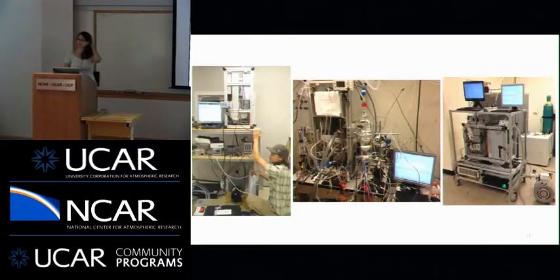So this instrument has gone through a few iterations. In SOAS, it was a bunch of wires, and most of them are hidden behind this computer. But we home-built a set of shelves at SOAS because it was our first project. We'd had the instrument for a little under a year at that point. Then at CalTech, it underwent a few changes and acquired more tubing and wires. And then more recently in our lab, we've got the system fully racked, and it's looking much more field deployable. And we'll be using it this summer at FRAPPE.